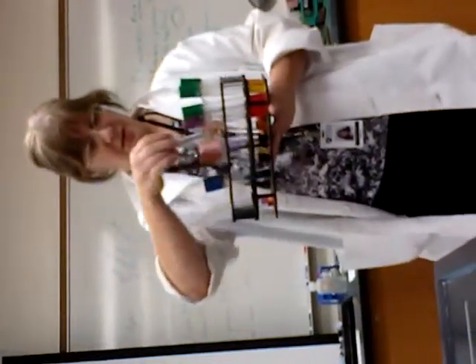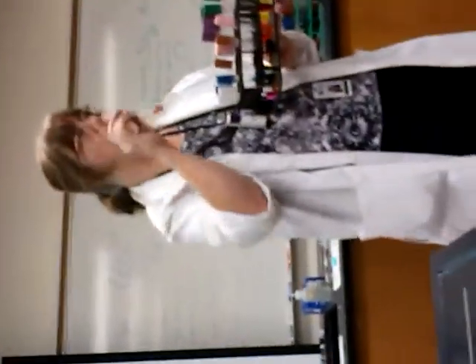Moving to the methyl red. The methyl red test starts off as just a straw colored test tube. You add what reagent? Methyl red. The droppers are over to the side. That's why they're there to look at. If it's positive, it will turn reddish in some form. In this case, you're looking for end products, not for what carbon source it has. This means mixed acid production. In this case, acids means red. Completely opposite from phenol red. If it's negative, it pretty much looks the same.